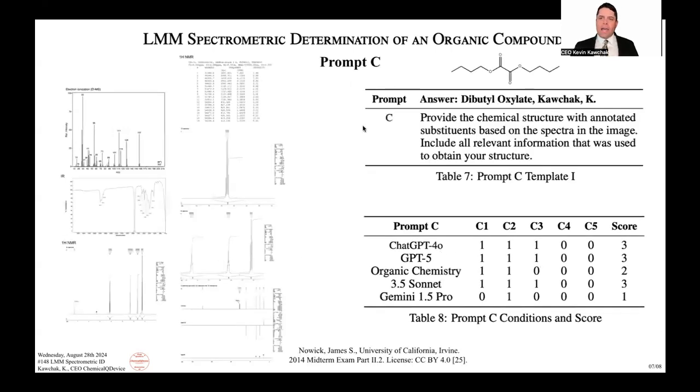Okay, so this is the last, and it didn't take me too long to solve this one. Now, the thing that pops up with this is that it has symmetry, and from the m/z of 202, that's the molecular weight of this dibutyl oxalate. There are definitely some fragments that would make sense to get this structure.